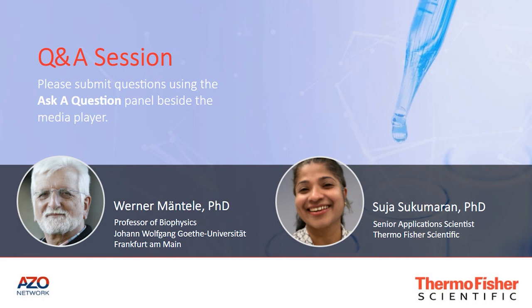You mentioned FTIR spectroscopy and quantum cascade lasers. What is the main advantage of using quantum cascade lasers? The main advantage of a quantum cascade laser is the high power at a distinct wavelength. So in the case of a Fourier transform instrument, you have a thermal source having a few nanowatts per wavelength interval as measuring light intensity. A quantum cascade laser easily has a few milliwatts, so you can get to better signal-to-noise ratio in this case.